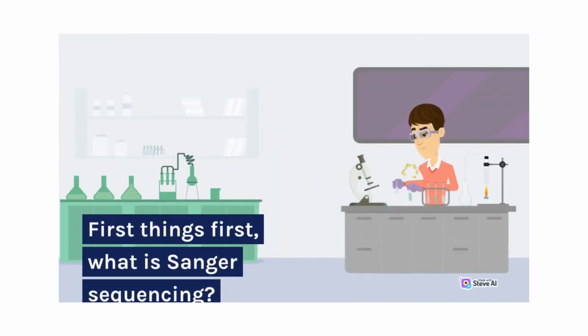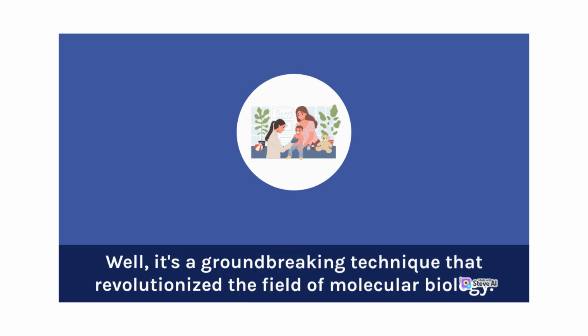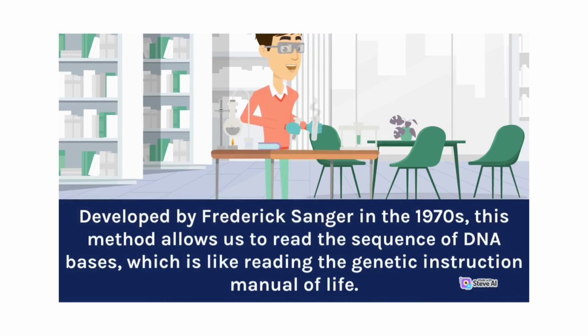First things first, what is Sanger sequencing? Well, it's a groundbreaking technique that revolutionized the field of molecular biology. Developed by Frederick Sanger in the 1970s, this method allows us to read the sequence of DNA bases, which is like reading the genetic instruction manual of life.